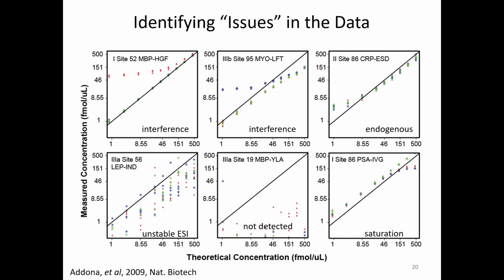And so if you can optimize for what you want to fragment and minimize what you don't, that is one way of using collision energy to reduce interferences, not eliminate them. But the different charge states should have different collision energies, and so that's potential. Other than that, I can't think of anything right now.